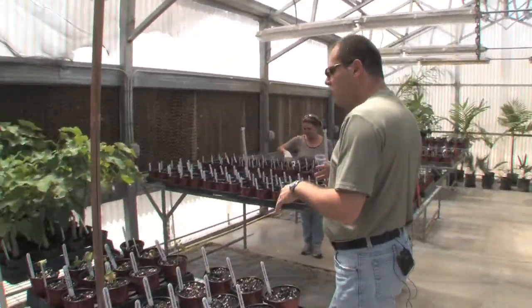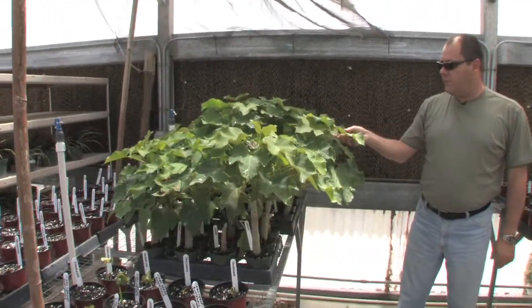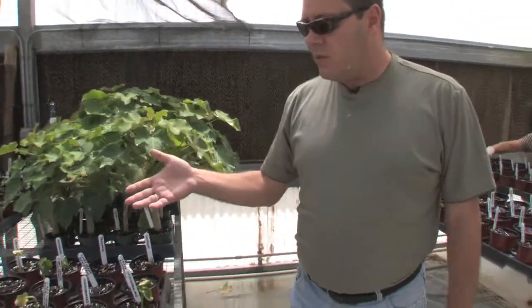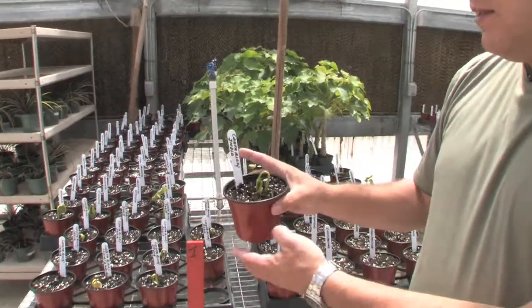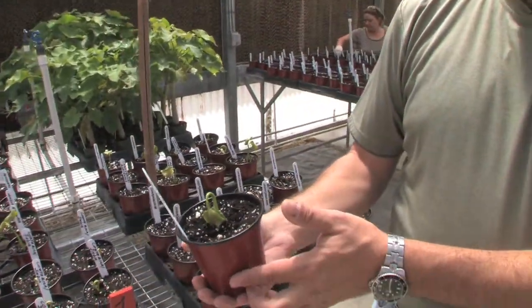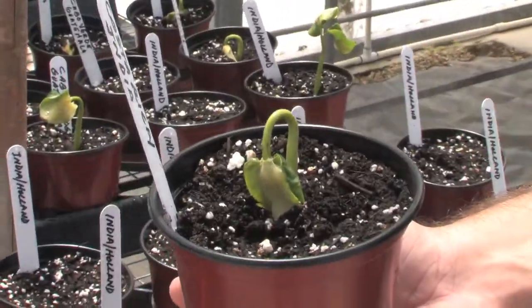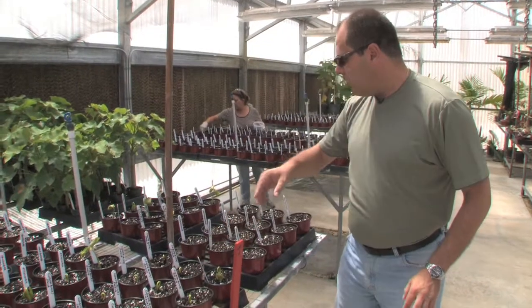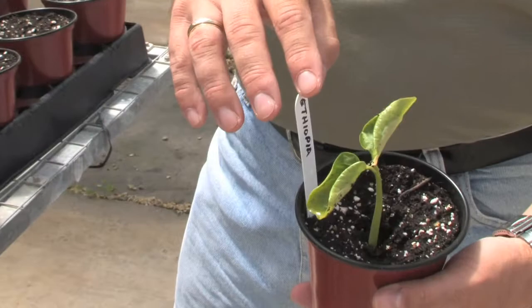and also from Brazil. There are some plants already germinating from India and from Brazil. These are older plants that have been sitting here where we did some preliminary testing. As you can see, we're starting to germinate the seeds, and they germinate quite fast. The seeds were placed here about five days ago and they're already coming out — in certain cases already with the leaves open, like in this case. This is seeds from Ethiopia.